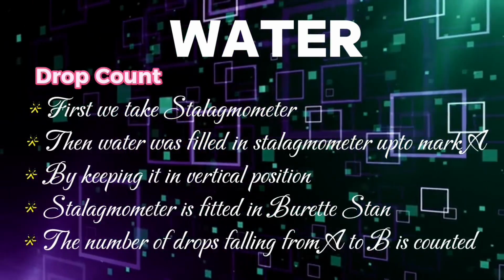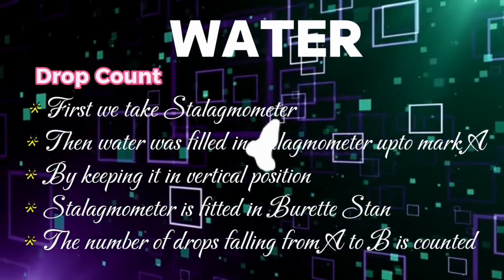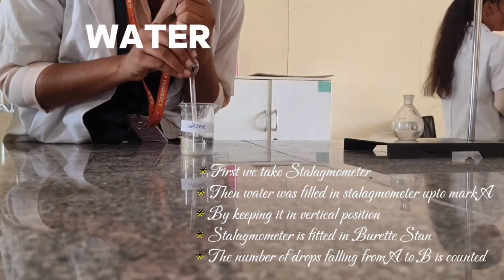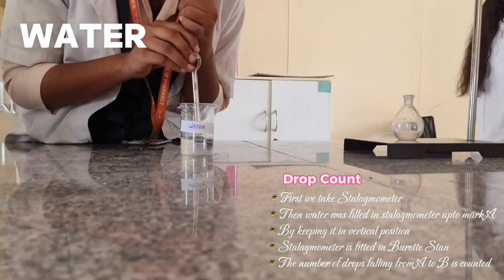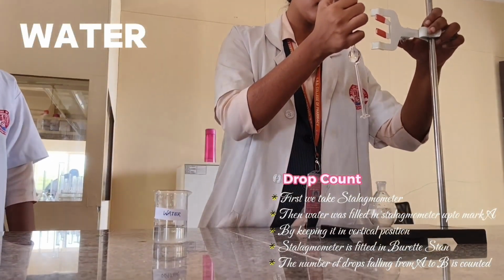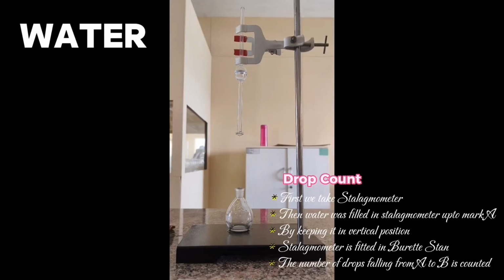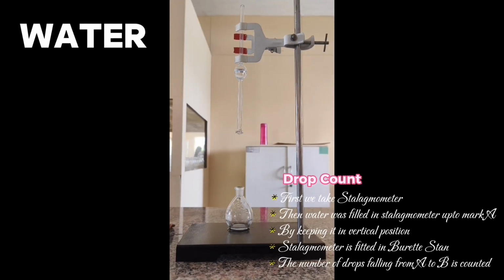The procedure: drop count method for water. First, we take the stalagmometer. Then water is filled in the stalagmometer up to mark A by keeping it in a vertical position. The stalagmometer is fitted in the burette stand and the number of drops falling from A to B is counted.